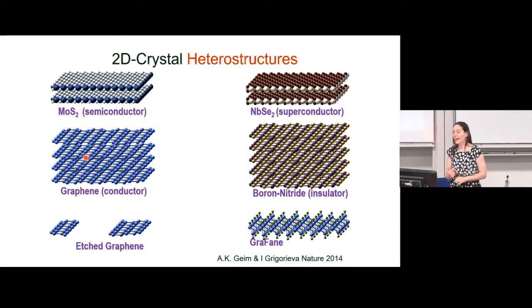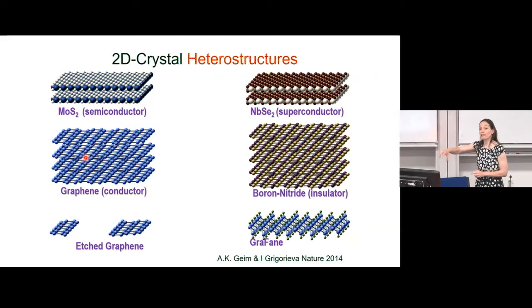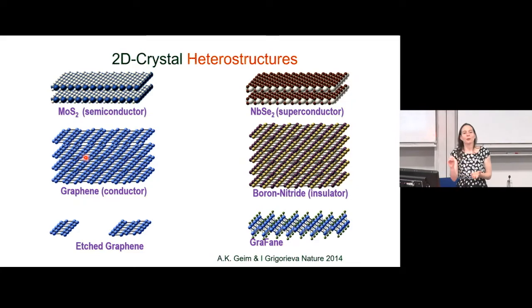And the reason I say that is because if you combine a layer of your material which has a gap in it, as you can see here, and you can just etch that using electron beam lithography, then when you combine these structures together, you will end up with a gap within your heterostructure. And I'll show you how we do that in a minute.